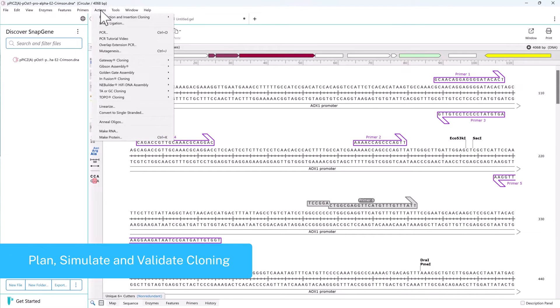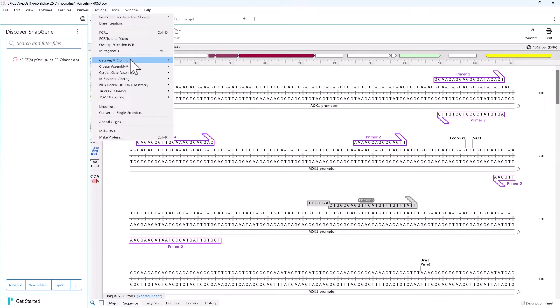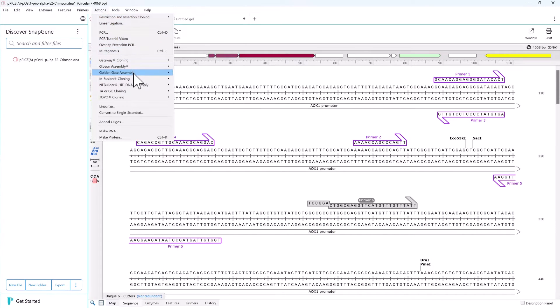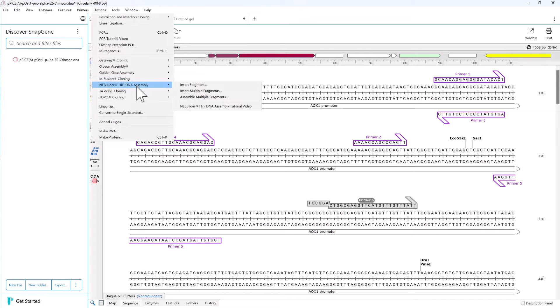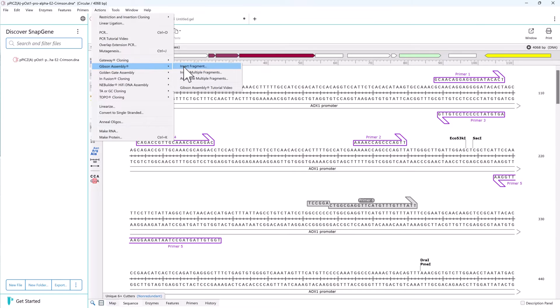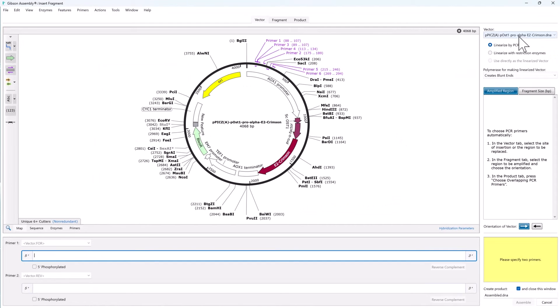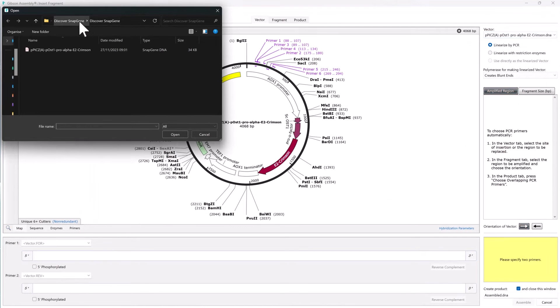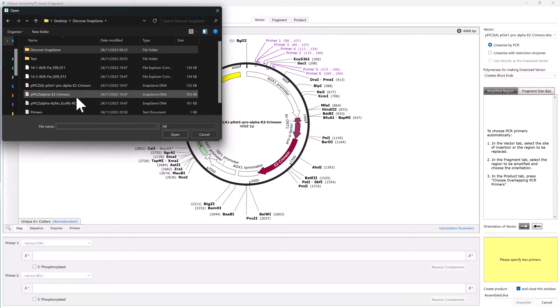SnapGene can simulate PCR, restriction cloning, Gibson assembly, InFusion cloning, NEB HiFi assembly, Golden Gate assembly, and Gateway assembly. Let's demonstrate and simulate Gibson assembly with one insert. Open the Gibson assembly cloning tool, choose the vector, and define the region for assembly.